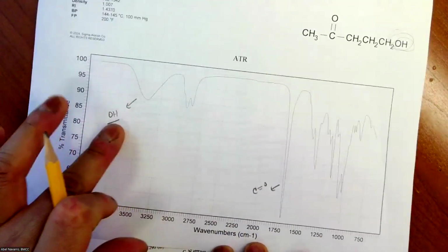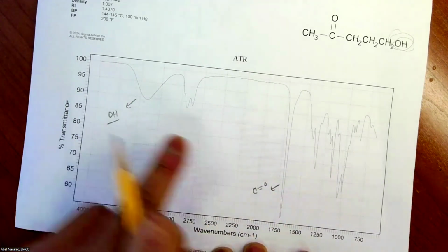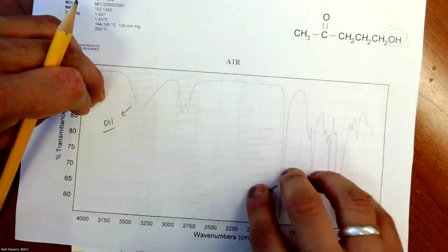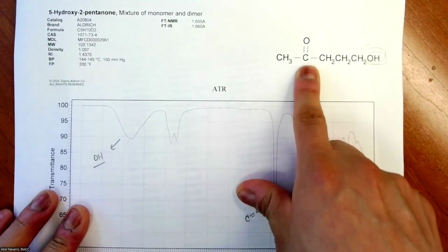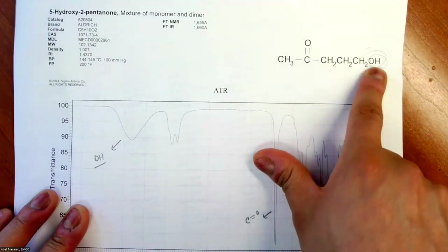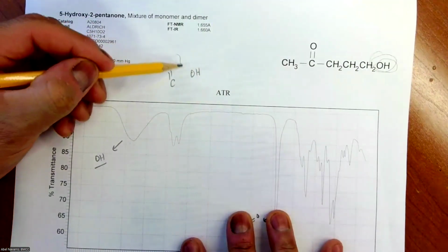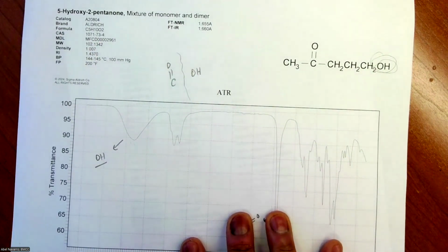Therefore, this OH is not connected to the C double O. It's not associated with the C double O. So if it's not associated, forget it. That means the OH is somewhere and the C double O is somewhere else, which is the case. The C double O is on the left side and the OH is all the way on the other side. This is a ketone and this is an alcohol. So it is possible. You can have a C double O and an OH and be totally different entities. They don't need to be carboxyl all the time.